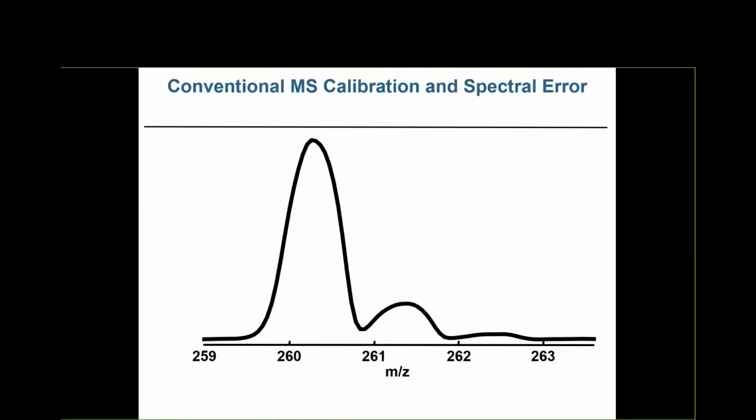So this is actually a real measured mass spec in profile mode, and you can see that the line shape is kind of distorted. That's pretty typical in mass spec, and it's really dependent upon what they call the tune of the instrument. And the interesting thing is mass spec is really the only analytical measurement tool where we can very accurately and very rapidly calculate any spectrum of any given formula based on first principles, because we know obviously the masses and we know the isotope distribution.